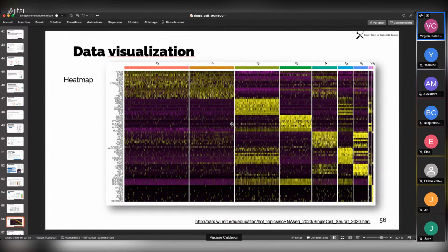Okay, maybe it's not two separated clusters, maybe it's just one. So you can either go back to the clustering and play with the parameters to decrease the number of clusters, or you can just decide to reassign the identity of this cluster to 0. So every cell here will be cluster 0. Okay, so that's my interpretation here. I should merge these two.